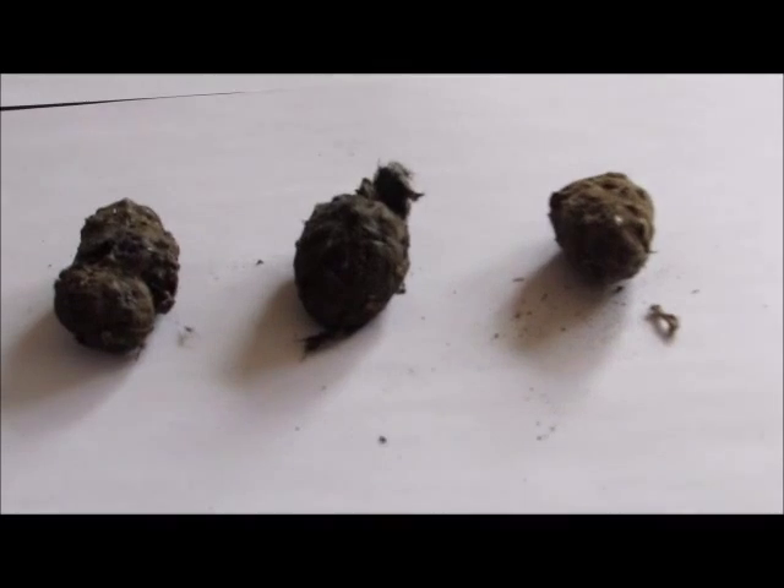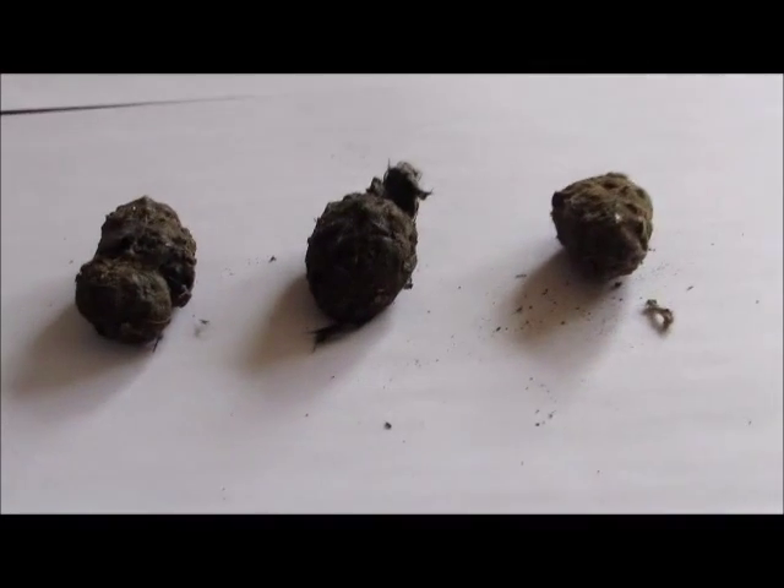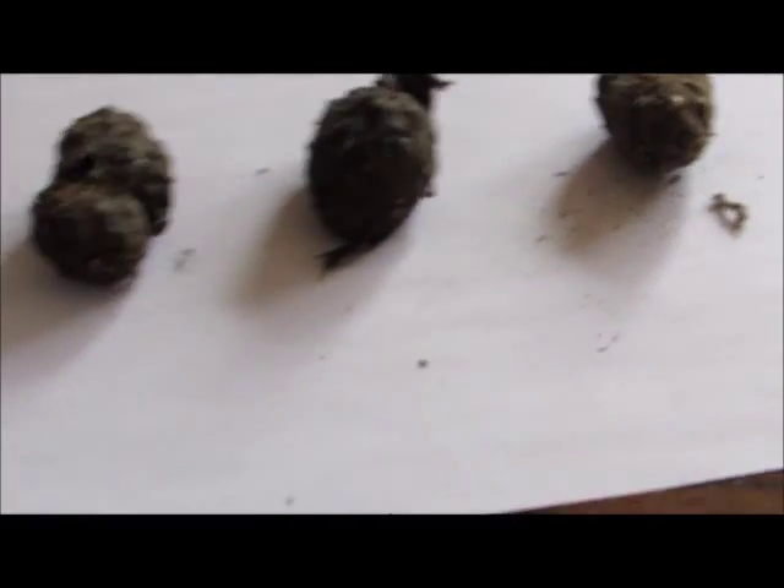Hey guys, Zach here. It's day 106 of my blog today, and today I'm going to be dissecting some owl pellets.